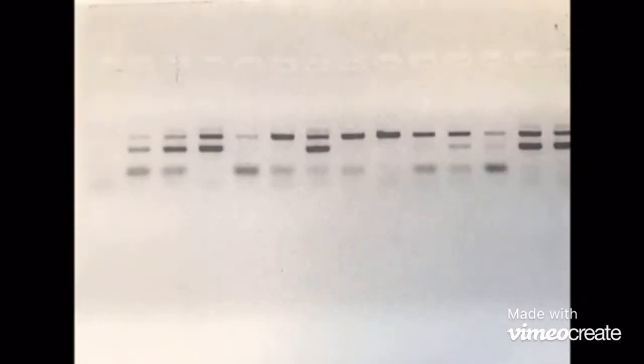Now our results came out great. As you can see, it came out clear, and with this information we can see that there are wild types and there are what we call heterozygous, when one parent has the NHEH gene and the other does not. We mainly use heterozygous mice as breeders.